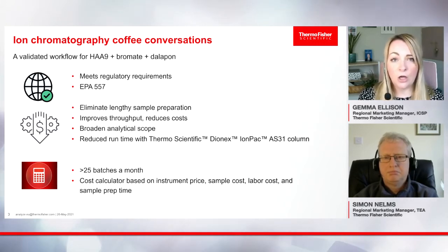So you can actually use a larger injection loop on the IC system, and the column, because of its high capacity, is designed to handle this.